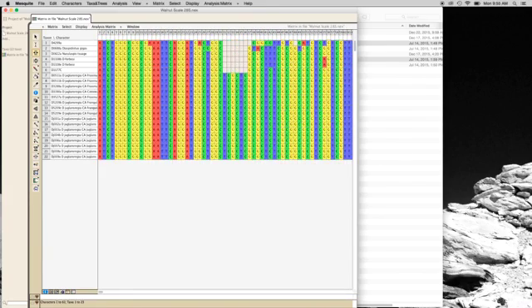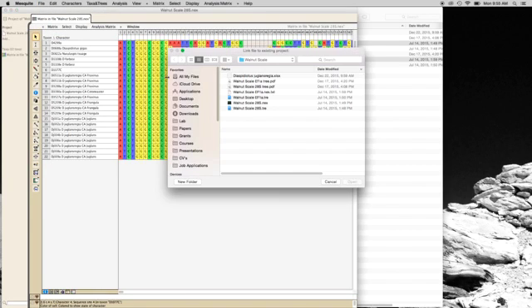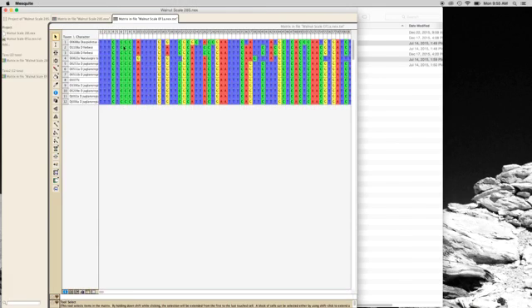So here we are. We've got our genes, we've got our taxa. One thing that we have to make sure of, though, is that our names are going to become important. So let's link our file now. File, link to our second gene region, which is EF1 alpha. All right, it shows up over here on the side, and let us see the matrix. Here it is. Now you see we've got a different number of taxa, so we had fewer individuals that we were able to sequence EF1 alpha from than 28S.